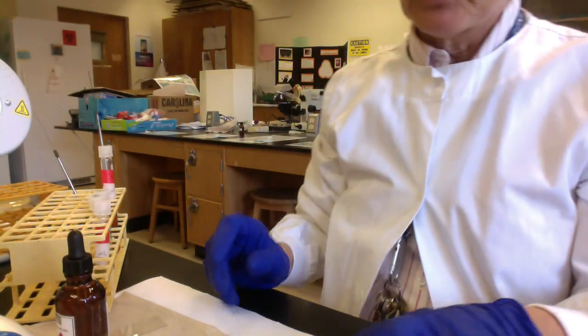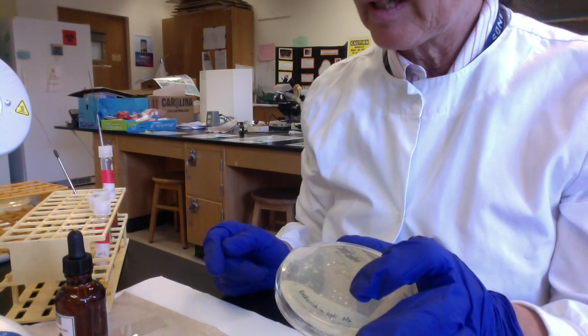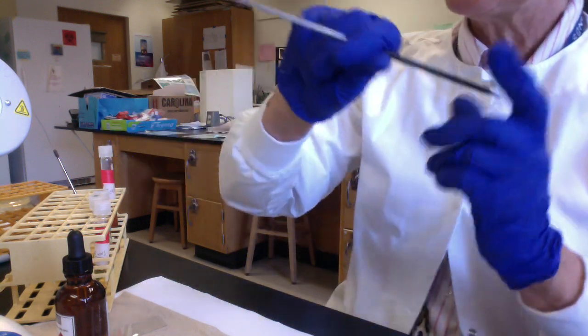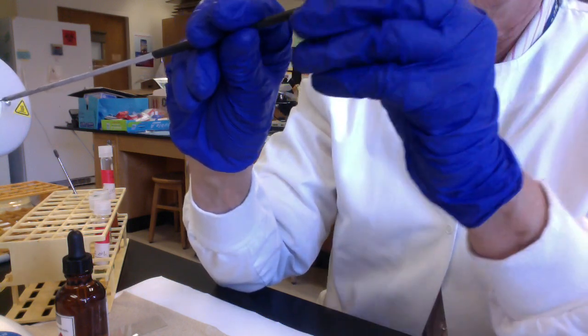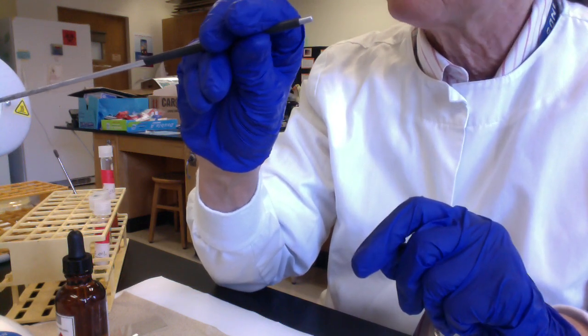Pages out of here. So again, folks, I'm just going to show you using E. coli, but we would run these same tests using our Enterobacter aerogenes. So the first test, folks, we're going to demonstrate is how to run the indole test. And back in the old days, you'd have to inoculate special indole media. It's a liquid medium that has a high concentration of the amino acid tryptophan.